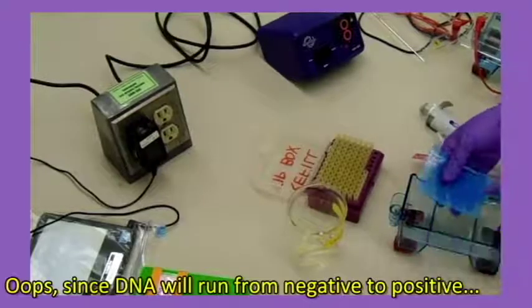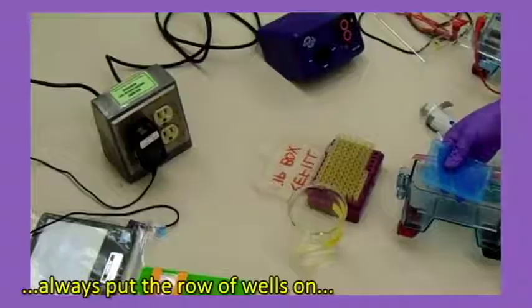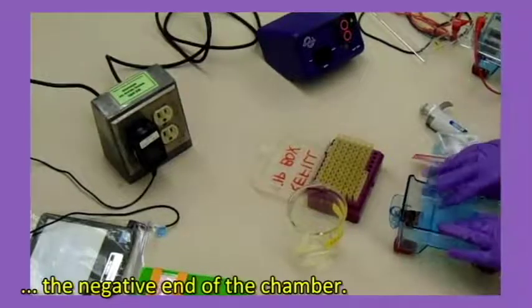Oops! Since DNA will run from negative to positive, always put the row of wells on the negative end of the chamber.